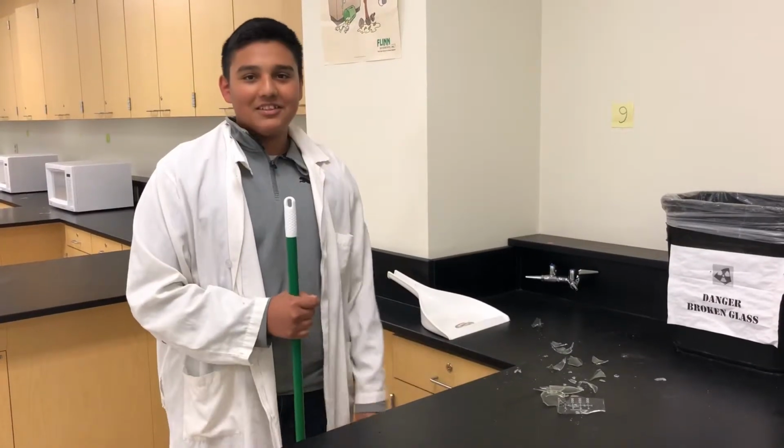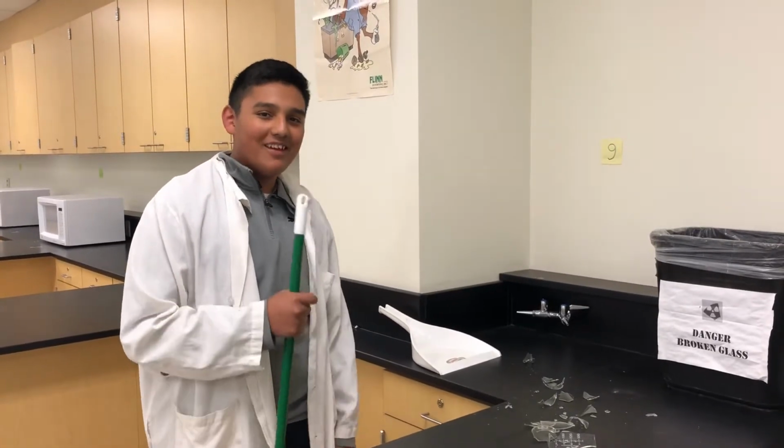Oh no, there's broken glass. You gotta tell your teacher immediately.